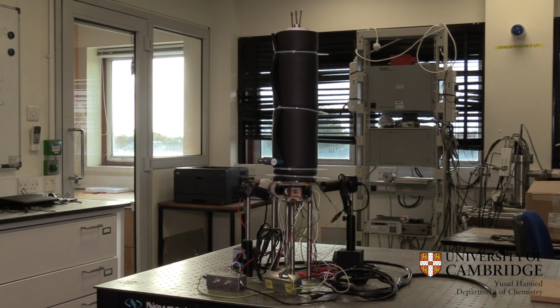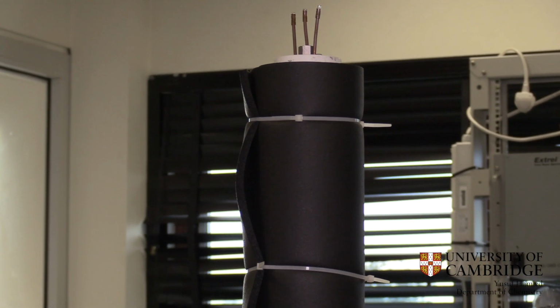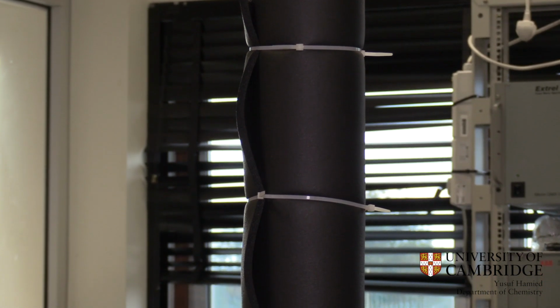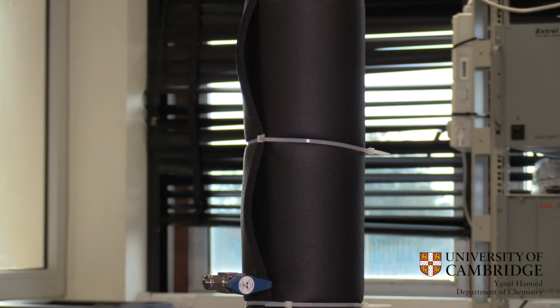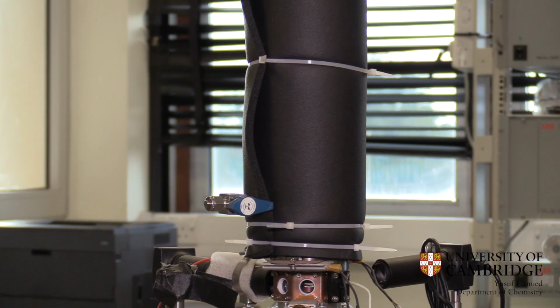This is the optical lab, and here you can see an electrodynamic balance. The electrodynamic balance can levitate and trap in the air a single atmospheric particle using an electrical field. In this electrical field, you can trap these particles and keep them suspended. And while this particle is suspended, we can do, for example, temperature changes or change the relative humidity.